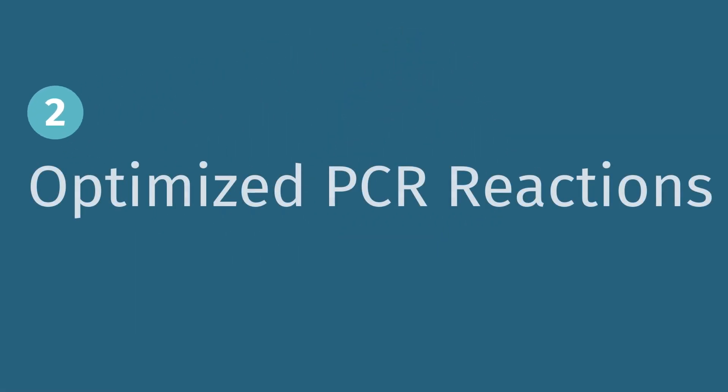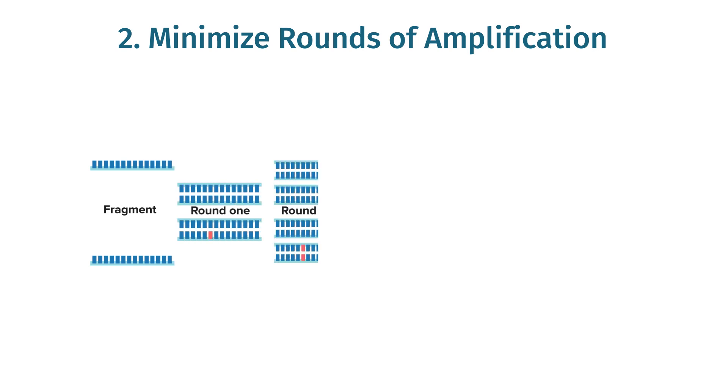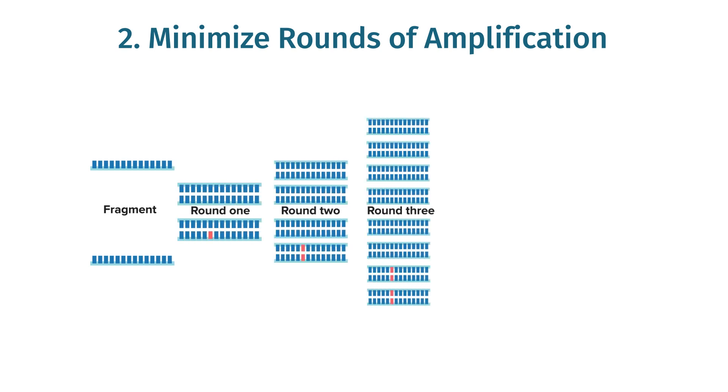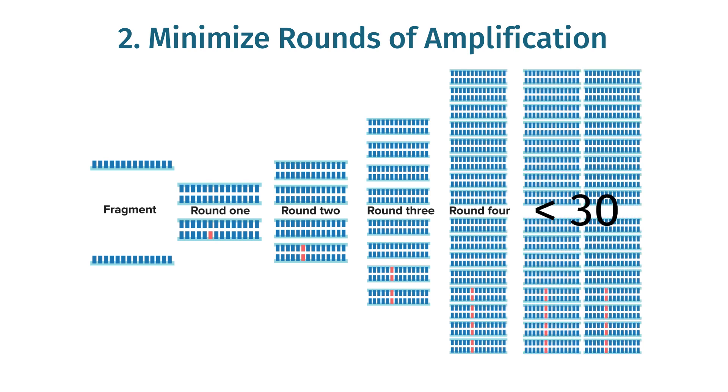Tip 2. Optimize your PCR reaction to minimize mutations and artifacts. Use a high-fidelity PCR polymerase for any PCR-based cloning technique, and keep rounds of PCR to a minimum, as each additional round of PCR will increase the number of mutations in your final product.